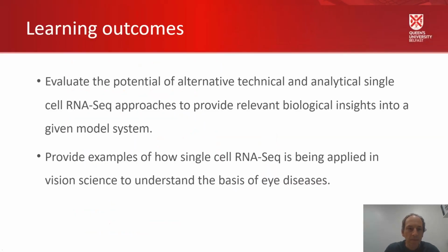So hopefully, after hearing about the various examples I'm going to talk to you about, it will help particularly people who are new to the field guide their use of single-cell RNA-Seq in whatever system it is that you're interested in. And hopefully it'll also pick up something about the basis of various eye diseases.